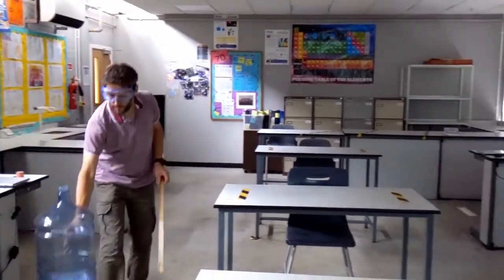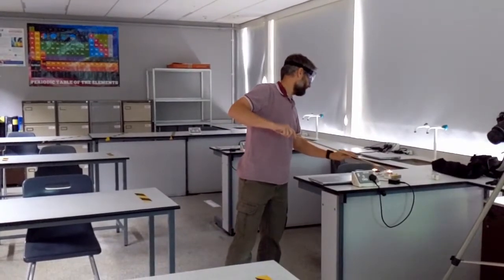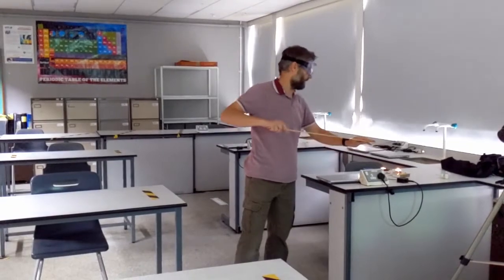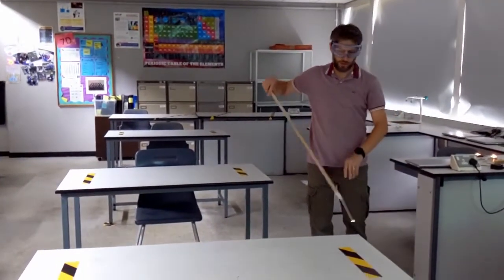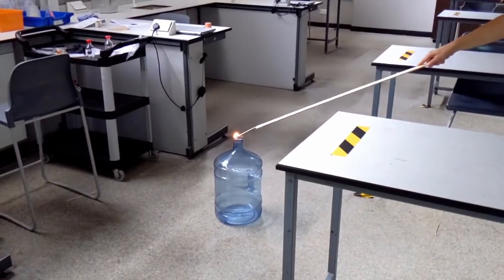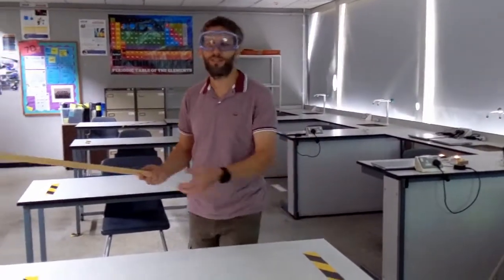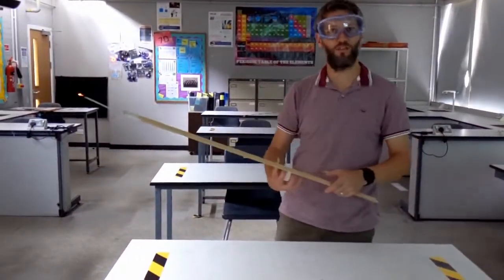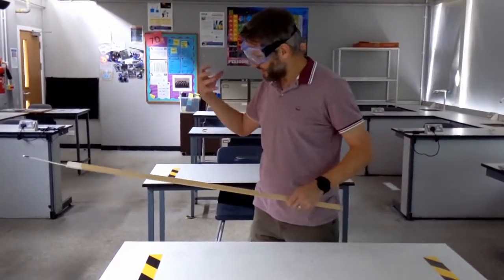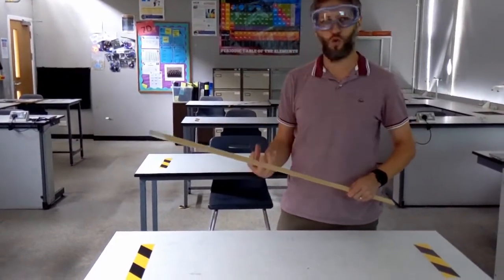What we're going to do, we're going to see what might happen if we light that. Just lighting a splint over here on a long ruler because I don't want to get too close to this, and hopefully you will see why. So that's what happens if we take a fuel and we put it in a confined space. We're generating a lot of heat, a lot of energy. You get that roar, that whoosh coming out the bottle as the energy is produced and forced out the top.